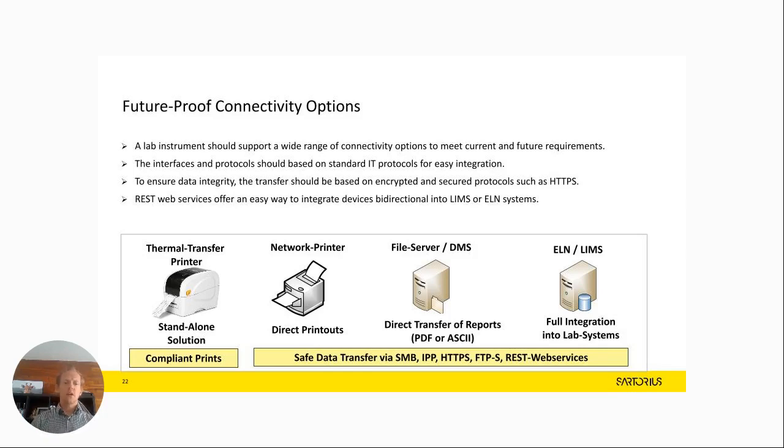So a lab instrument should support a wide range of connectivity options. Yes. The interface and protocol should be based on standard IT protocols. I can agree on that too. So what do we do? We still have the normal printer. If someone wants to work with a normal lab printer, it works completely fine.